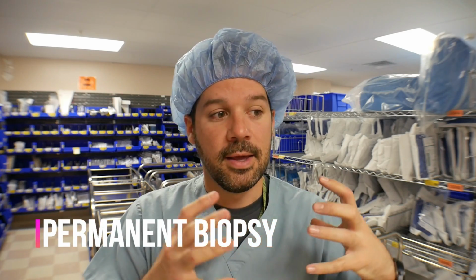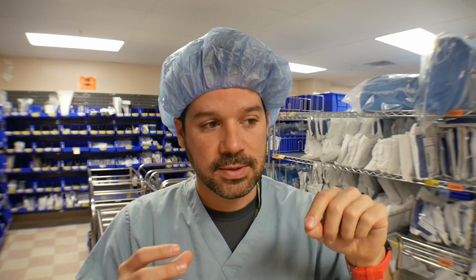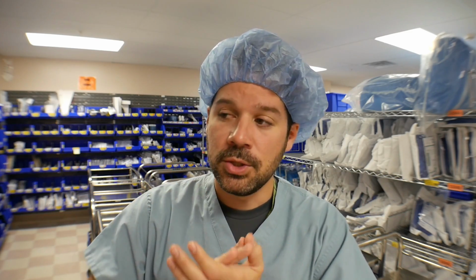That's why we also take permanent specimens as well, and the permanent specimen is more than likely going to be the entire excisional biopsy, the entire tumor. The fresh frozen section is just a piece of that tumor. The permanent specimen is going to be the entire thing, and it's going to be placed in formalin in a container, and usually it's sent out to be read at another facility.